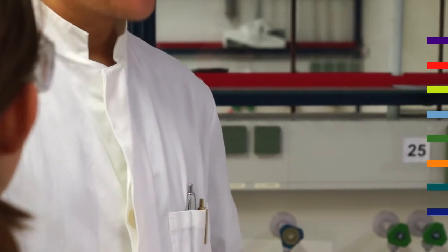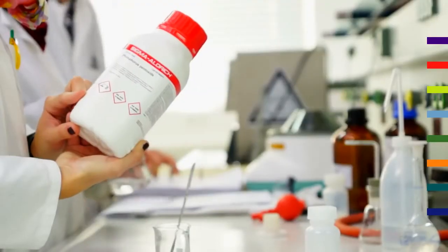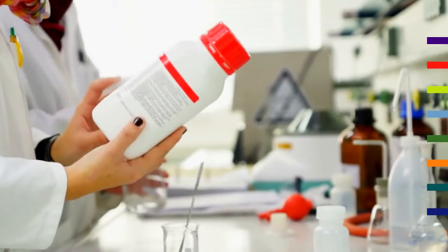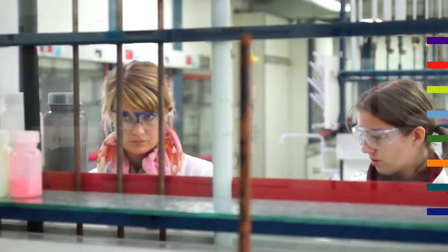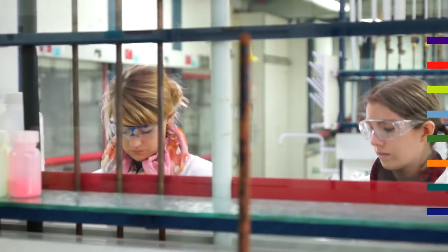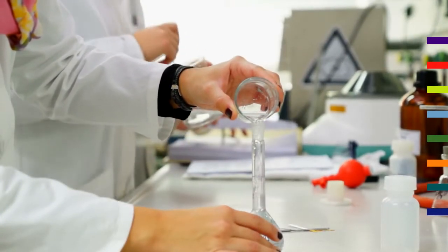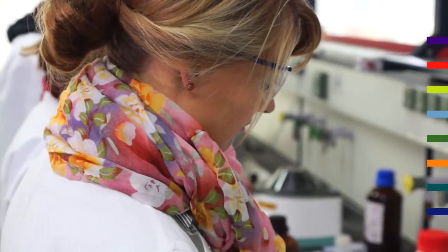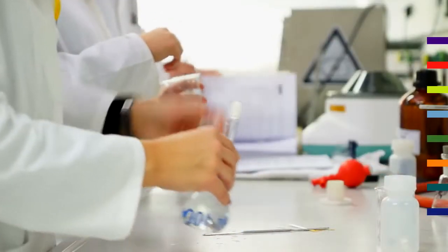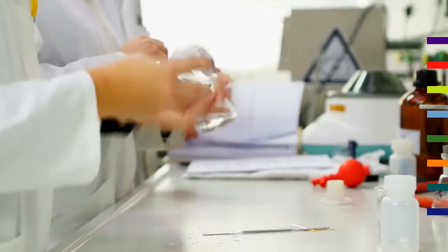Furthermore, he ensures that there is a copy of the Technical Rules 526 for dangerous compounds in every laboratory and makes sure that these rules are being observed. The Technical Rules for Dangerous Substances, or in brief TRGS, reflect the present knowledge of technology, occupational medicine, and occupational hygiene, as well as other proven scientific facts for working with dangerous substances. This includes their classification and labelling.